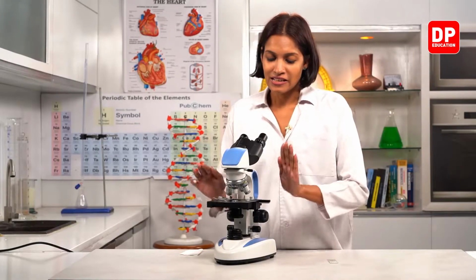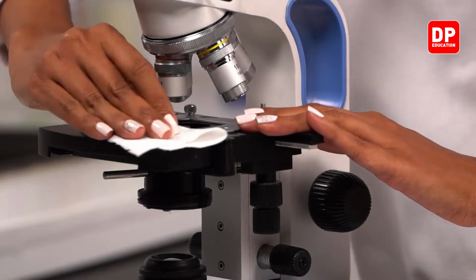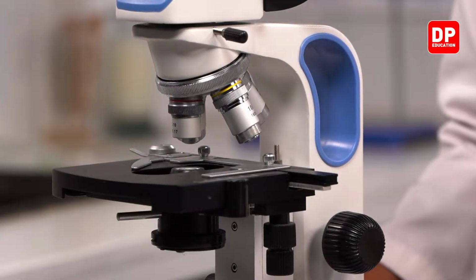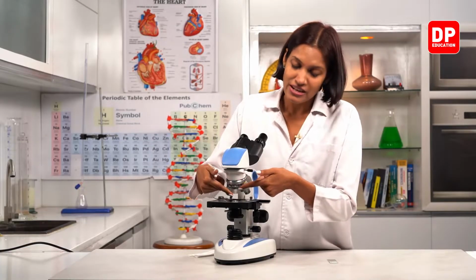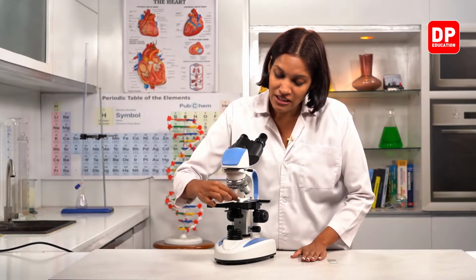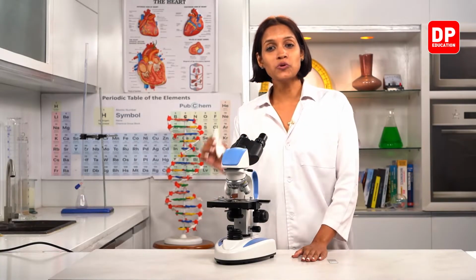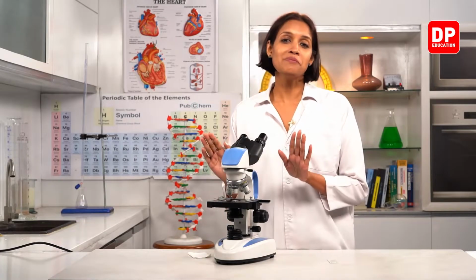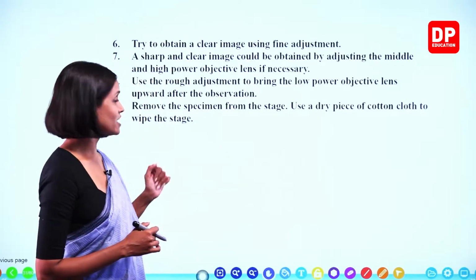And finally, after using this microscope, we need to wipe the stage with a clean piece of cloth or clean piece of cotton to remove any moisture. Right? What is the reason? Otherwise, if there's any moisture left, it will harm the lenses by forming fungus. Right, children? So we have to make sure that we nicely wipe off the stage with a clean piece of cloth or clean piece of cotton. So I hope you got a better idea about using the microscope correctly. Right, children? So you observed how to take all these steps.